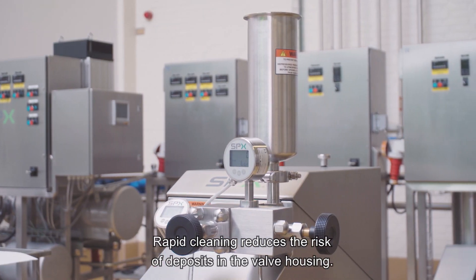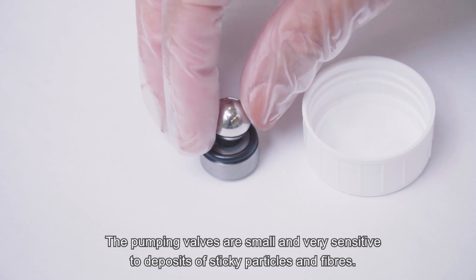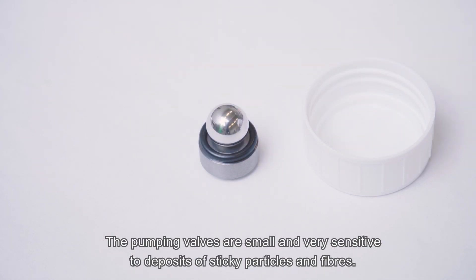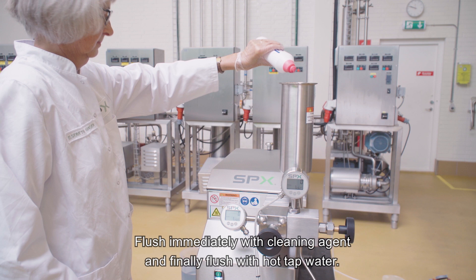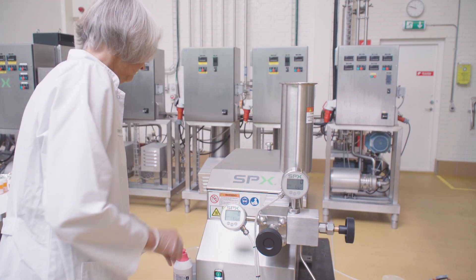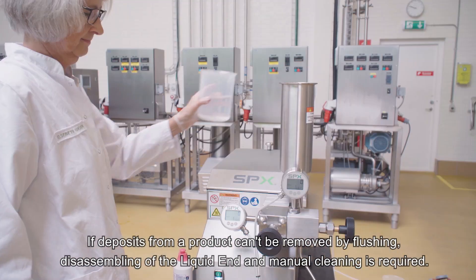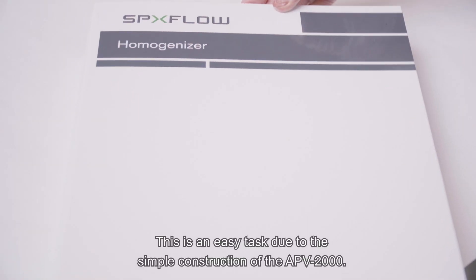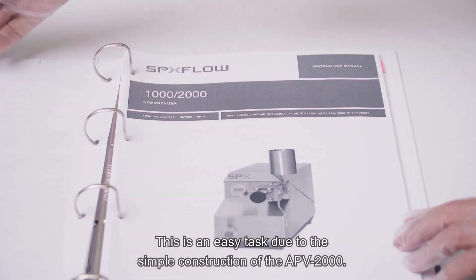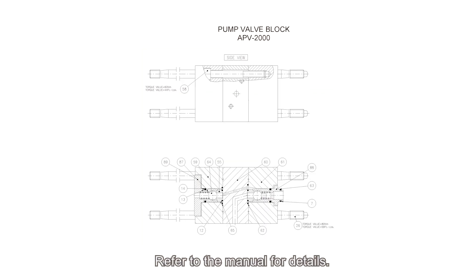Rapid cleaning reduces the risk of deposits in the valve housing. The pumping valves are small and very sensitive to deposits of sticky particles and fibres. Flush immediately with cleaning agent and finally flush with hot tap water. If deposits from a product can't be removed by flushing, disassembling of the liquid end and manual cleaning is required. This is an easy task due to the simple construction of the APV2000. Refer to the manual for details.